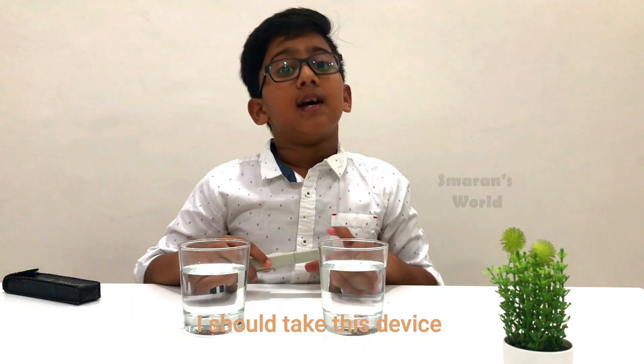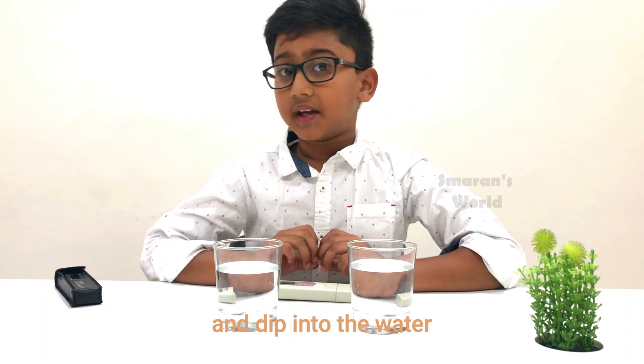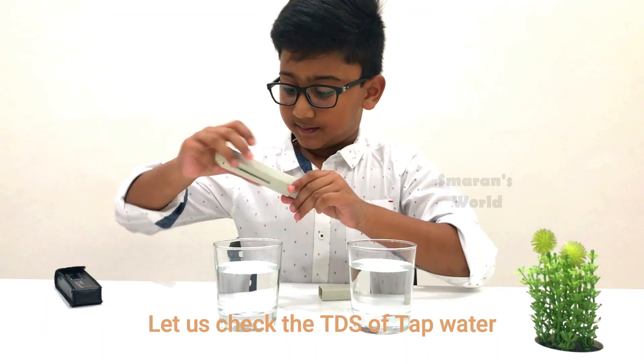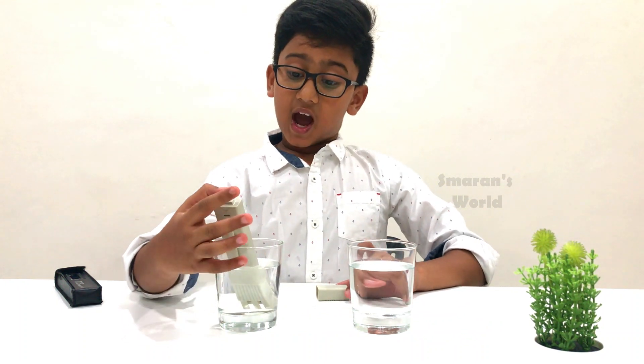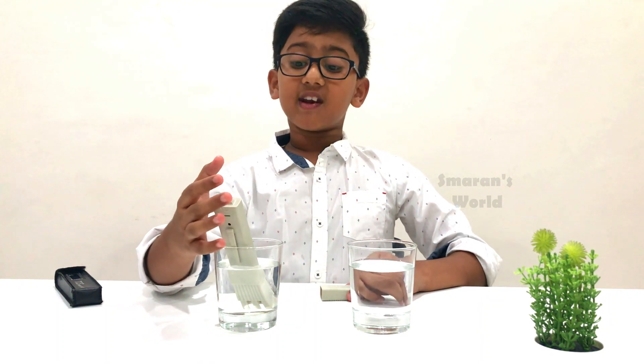All I need to do is take this device and dip it into the water. Now let us check the PPM in the tap water. One seven nine into ten — that means one thousand seven hundred and ninety. It is not at all safe for drinking.